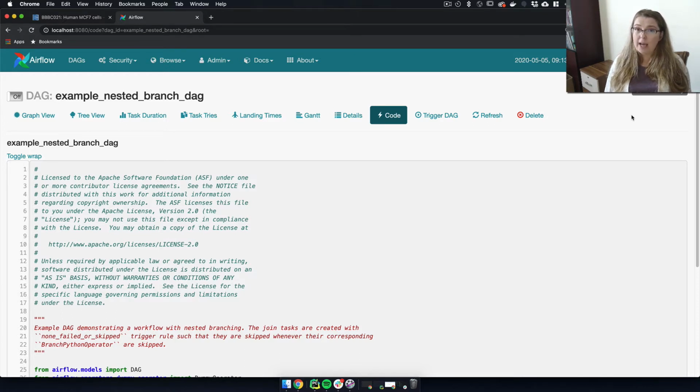And then when you're actually executing your tasks, you may need to execute them other places. So for instance, back to the LIMS example, you have the LIMS, you have some sequencing that's done or a microscope that's done, and then maybe you have an in-house HPC system. Well, you could tell Airflow to go trigger a task on the HPC by using the SSH executor. So that's an idea.